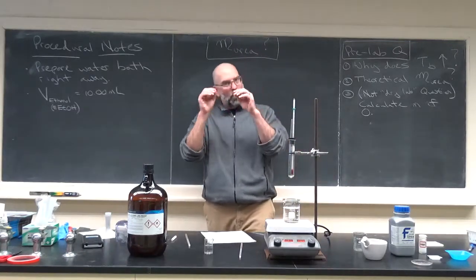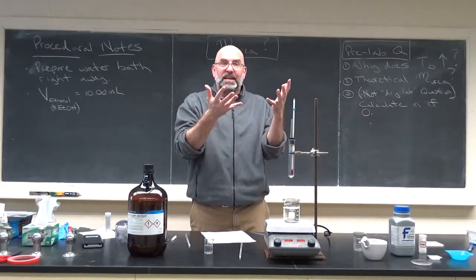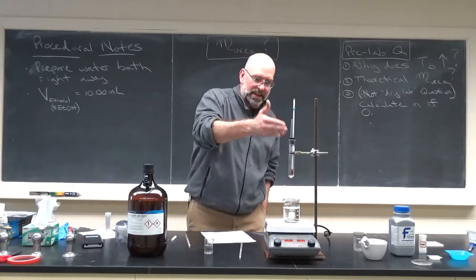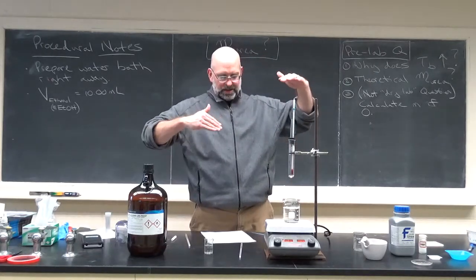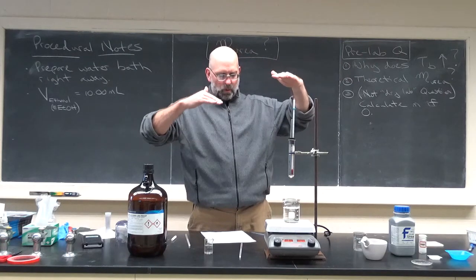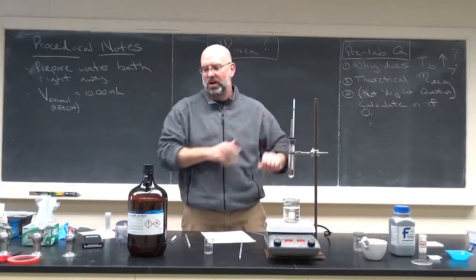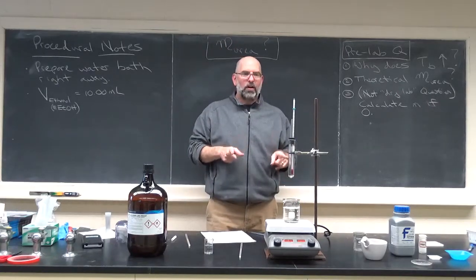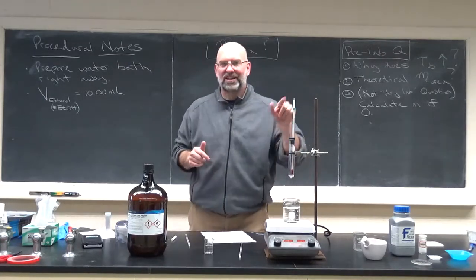If you don't get 90.0, that's fine. Keep in mind, all we want to do is use this as enough to heat it so that the ethanol in the interior boils. And there's, what is that, like a 21.5 degree difference. Actually a little less because we're above sea level, but we're not going to get into that too much.